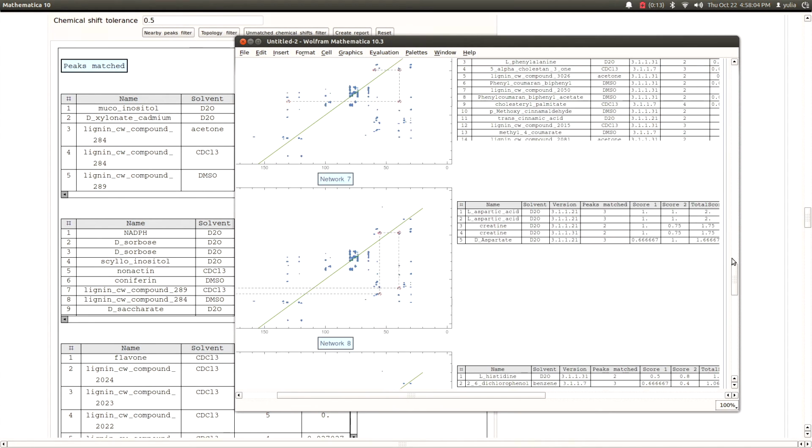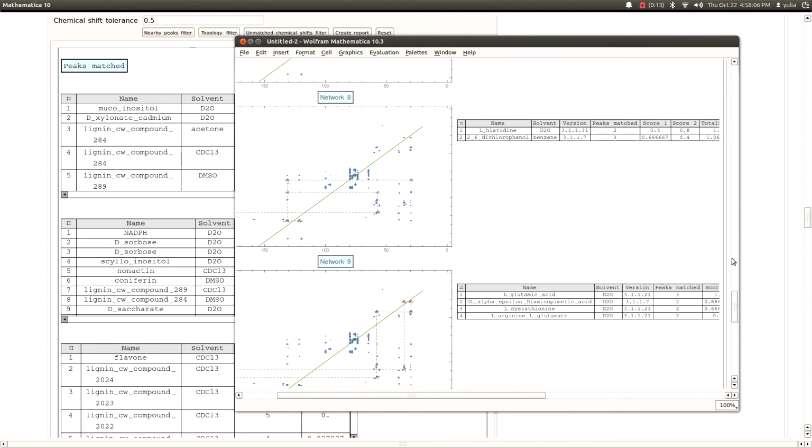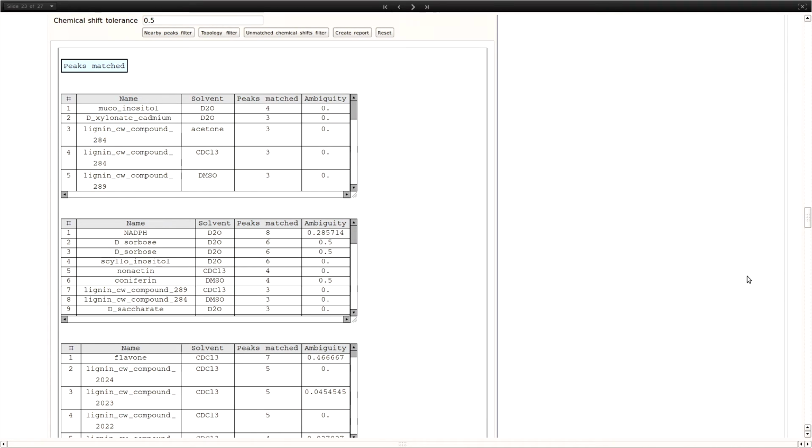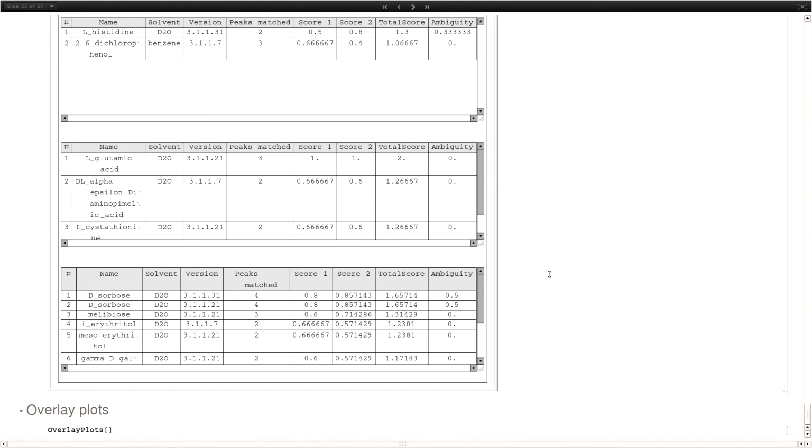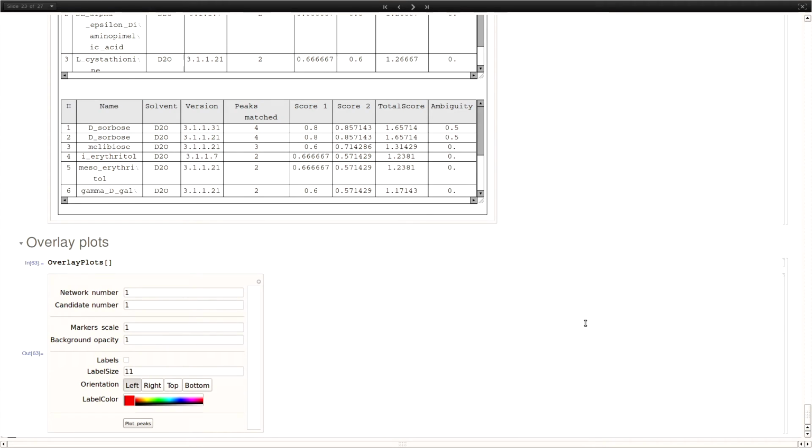well-matched compounds. Well, I know they're well-matched because I know the data, but you don't, but I can show you that. We also have a little tool here. Most people don't have an automated way to find this kind of networks and identify compounds in this kind of experiment. So I think maybe network 7.